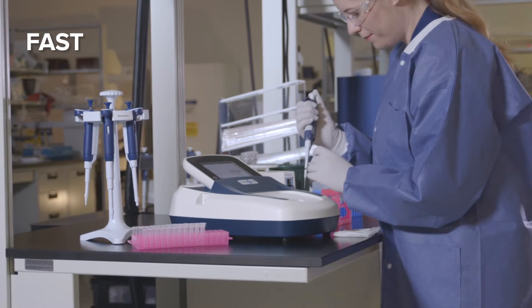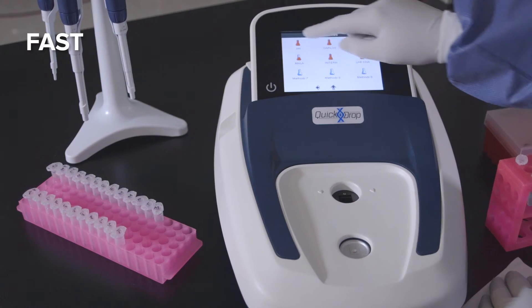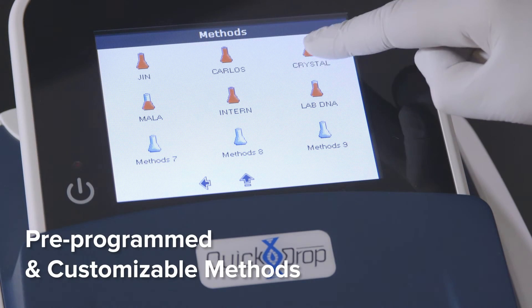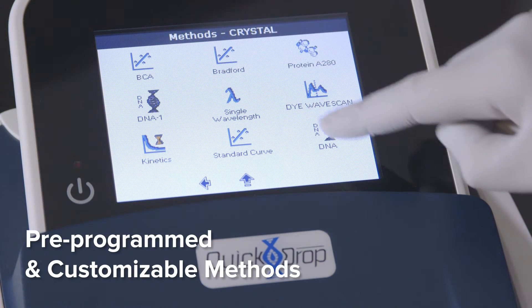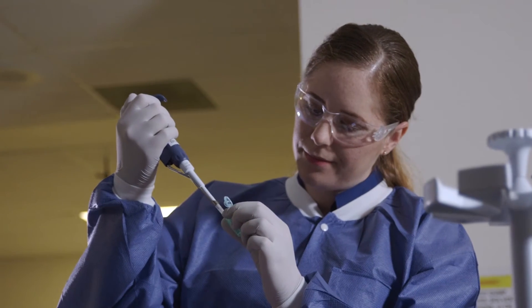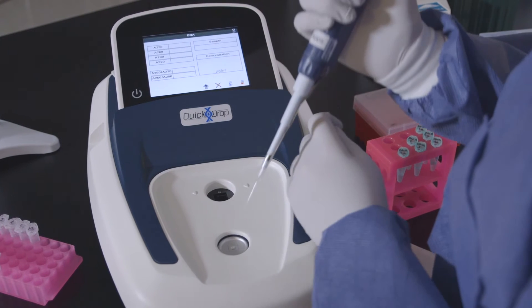See results in seconds. The intuitive high-resolution touchscreen makes testing easier than ever with pre-programmed analysis methods to speed you through the process. We've done away with moving parts to increase both speed and accuracy in testing for better measurements.